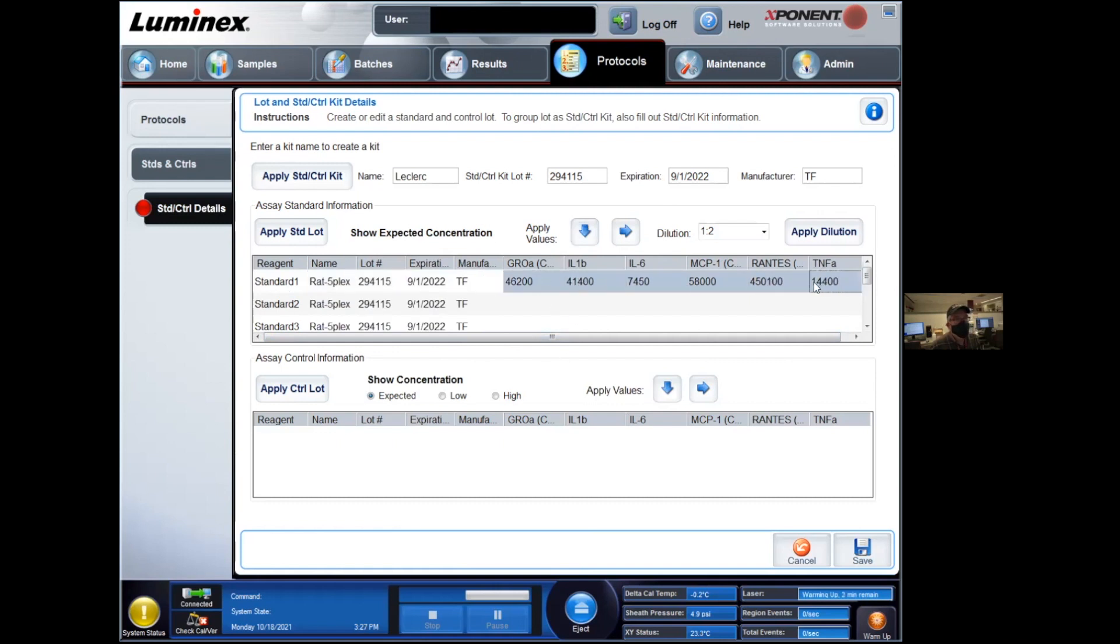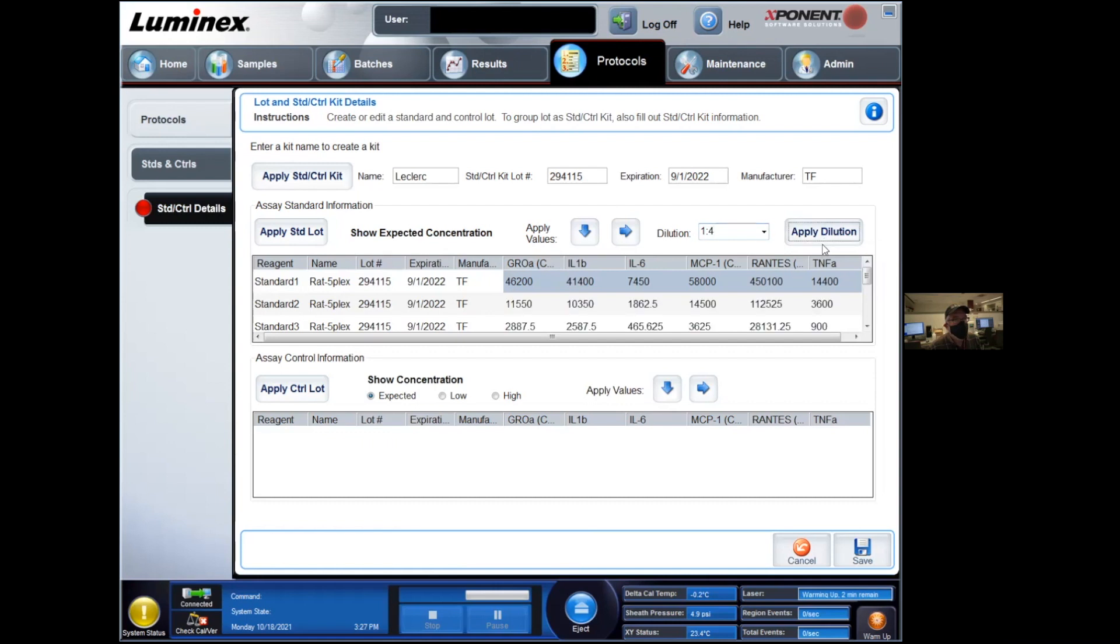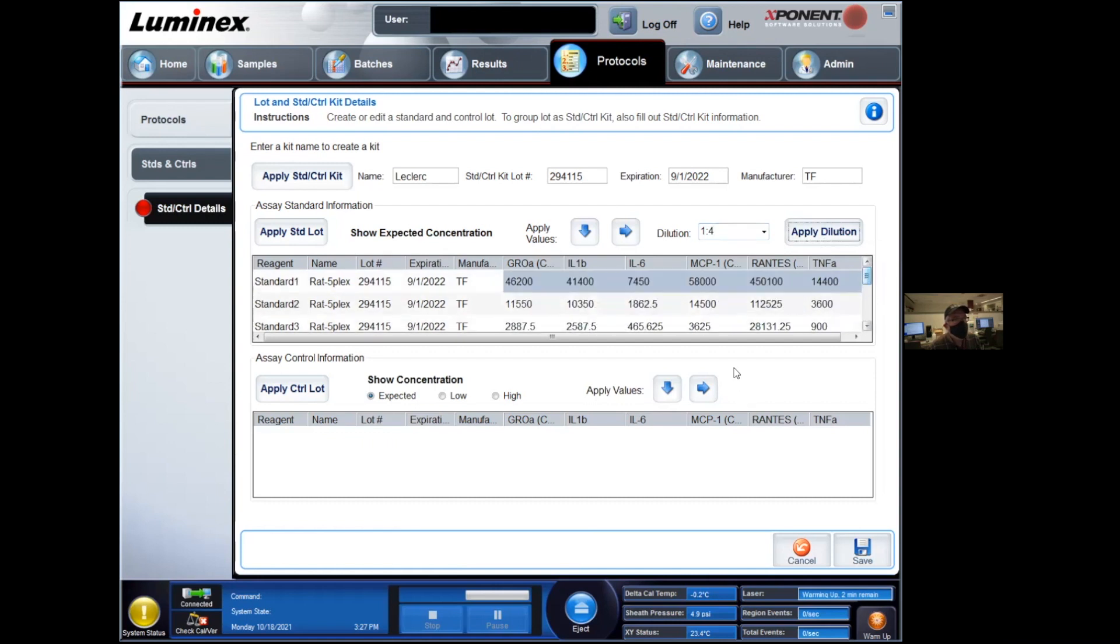And now for these values, where we did a dilution for my standard curve, the dilution factor is found in your protocol and you can simply apply a specific dilution that you've made. So say it's one in four, apply the dilution to all of these wells here, and it's going to automatically enter the values below.